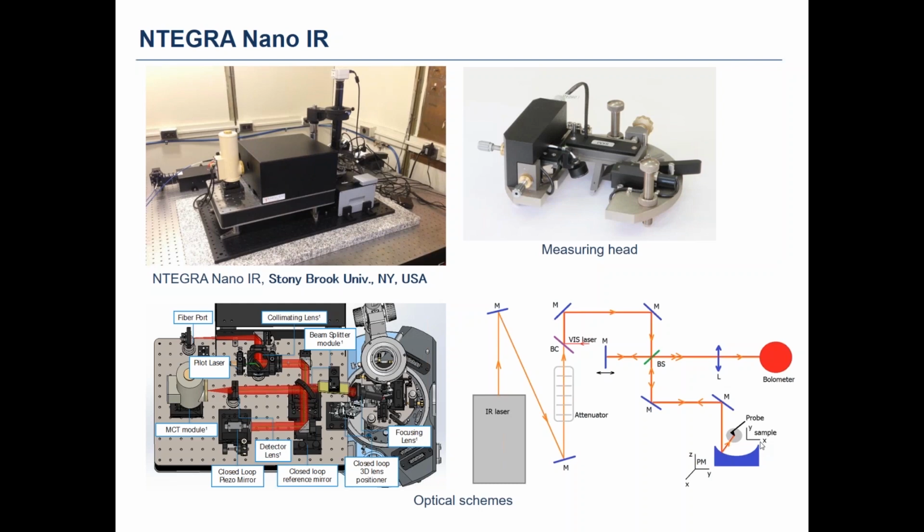Okay, one more question. Could you measure infrared spectra with your system? Yes, we definitely can. In our laboratory system, we have a laser with a fixed wavelength. This is a CO2 laser, but the whole system is designed to operate in the spectral range from 3 to 12 microns wavelengths, and actually it can be expanded up to 20 microns.